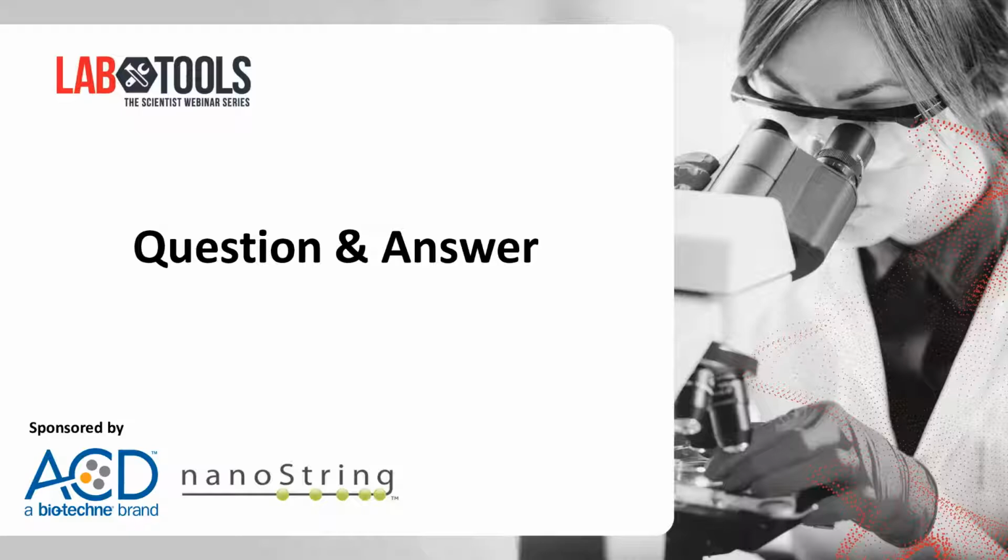Our first question will be for Kit, and that question is, what's the smallest size of the ROIs you can use? And I suppose as a follow-up, we can ask Anushka too, how does the size of ROIs impact compatibility with single-cell analysis?